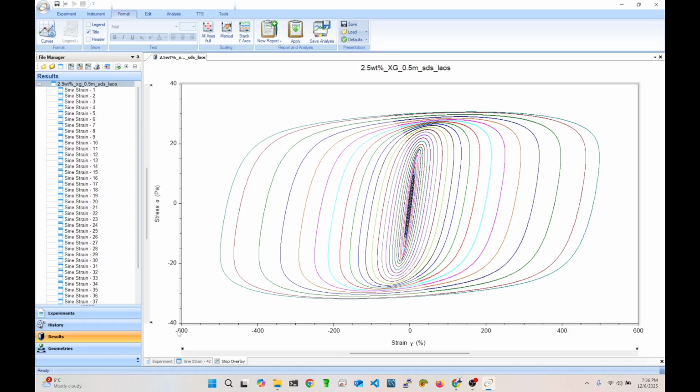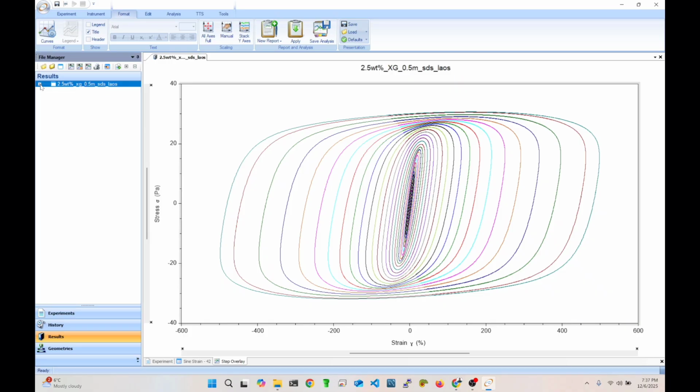You can see this is 600, so probably this is 500. The strain sweep began at some small amplitude up to 500%. Depending on your rheometer type, you might have a similar thing, but OSR-Tool can handle all kinds of data, both computationally generated data, like using some model, or experimental data. But I would like you to see what is in this file.